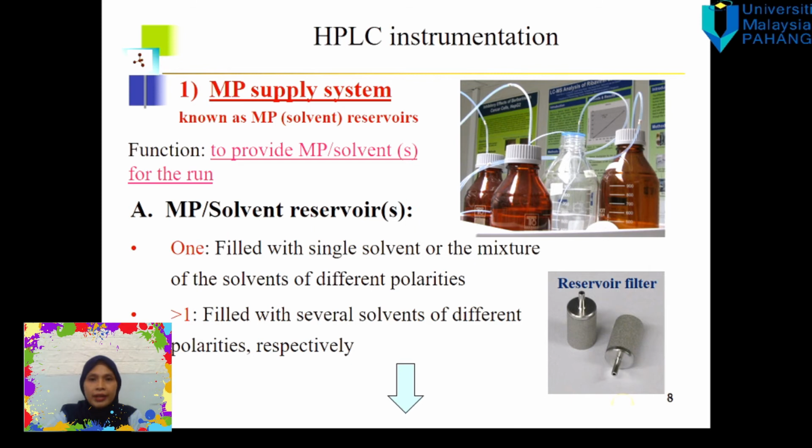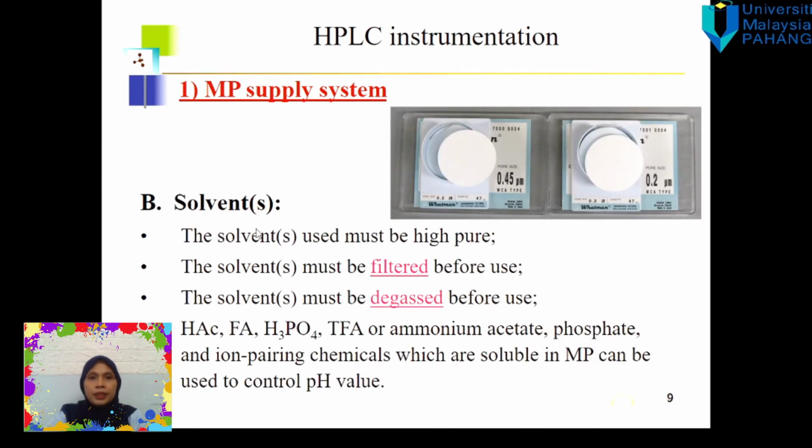It can also be done like that. For the mobile phase, the precaution that we need to take care of is to make sure that the solvent is high purity, filtered, and degassed. And for the buffer solution, we need to control the pH value.